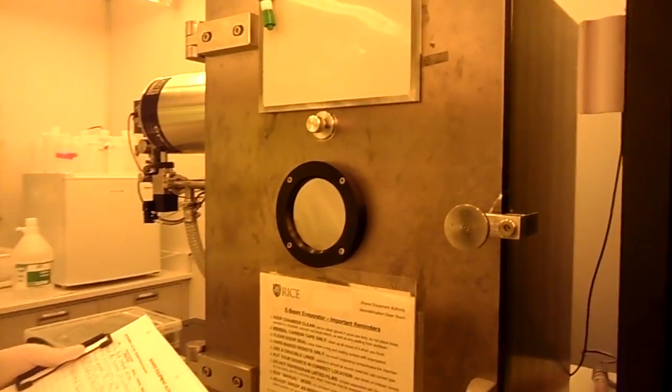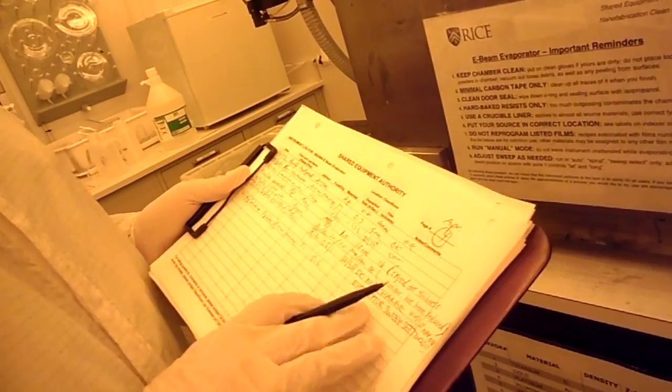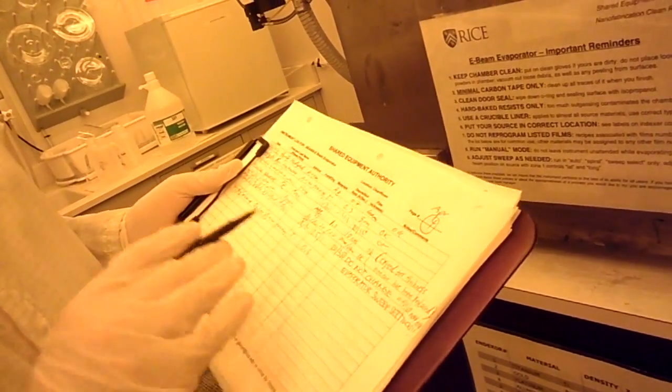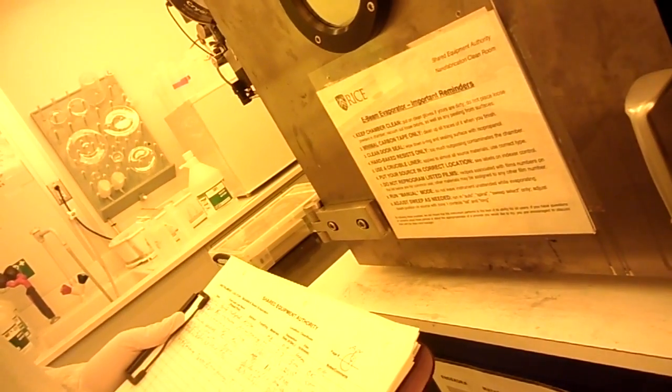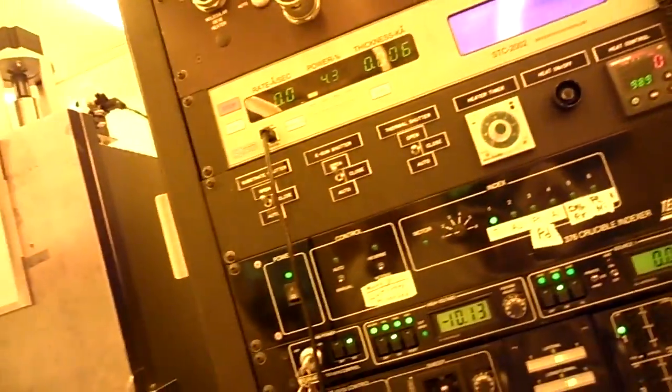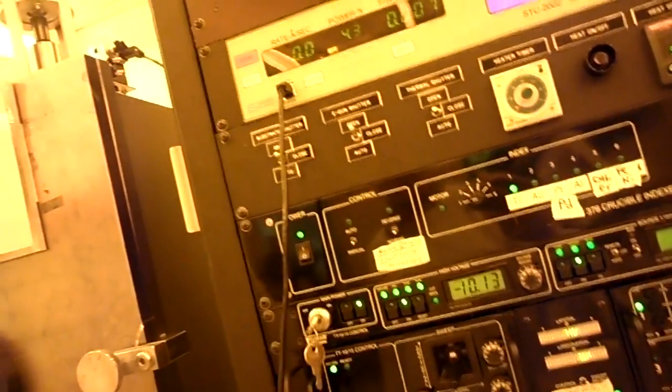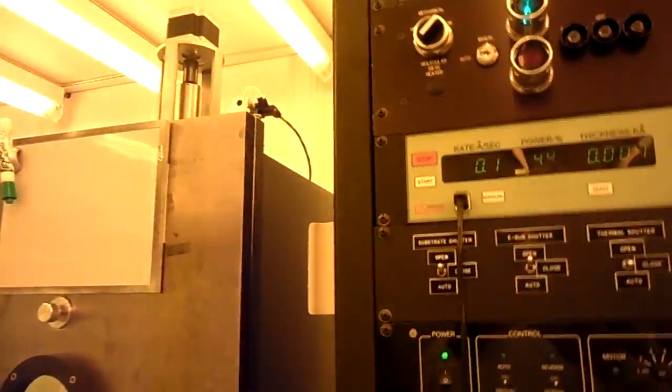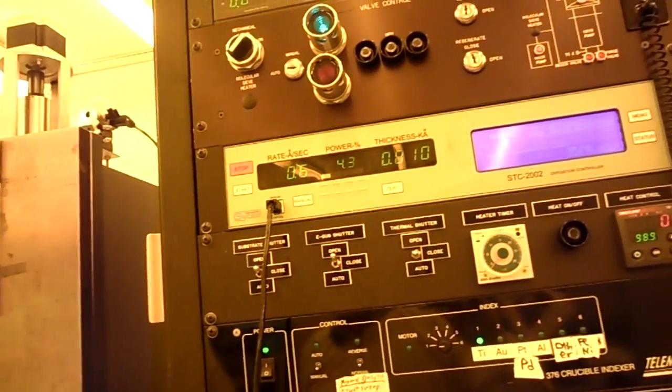The rate, a lot of people when they're doing research samples, they're going to get a steady rate and do that. So, this is for demonstration, so it's not that critical what my rate is. You know, we can talk about the thickness I put down. We'll write that down when we're done. So far, everything appears to be okay. So, I'm going to preemptively write an okay here. But if something presents, you can make a note. This person here, she called me on the weekend. Someone had changed the sweep settings, and it wasn't working. So, I had to walk her through which switches to flip back because she was not 100% sure what was wrong. So, I had her check a couple of things, and then we decided what we needed to reset. And for some reason, our rate has gotten a little weird.